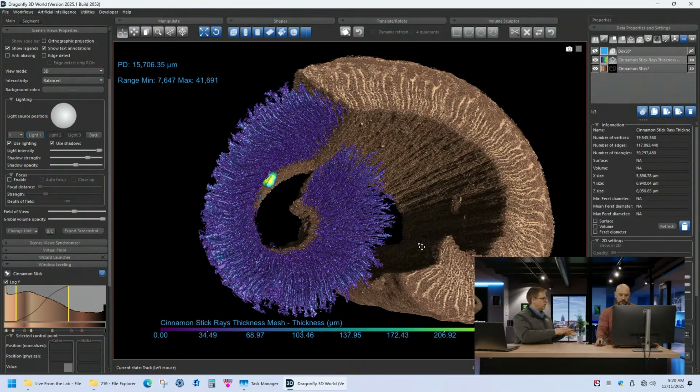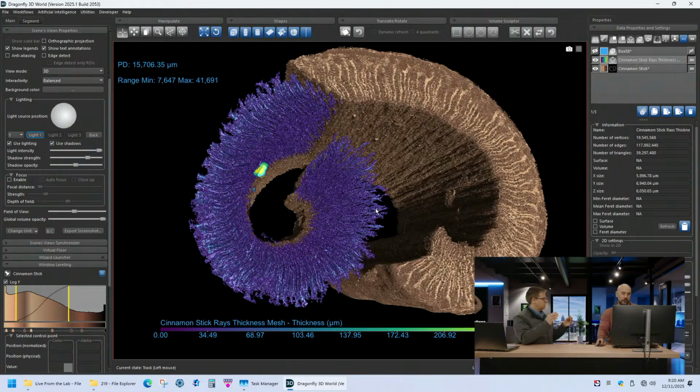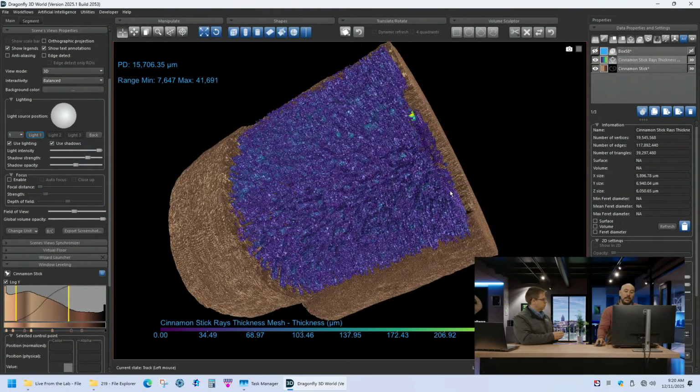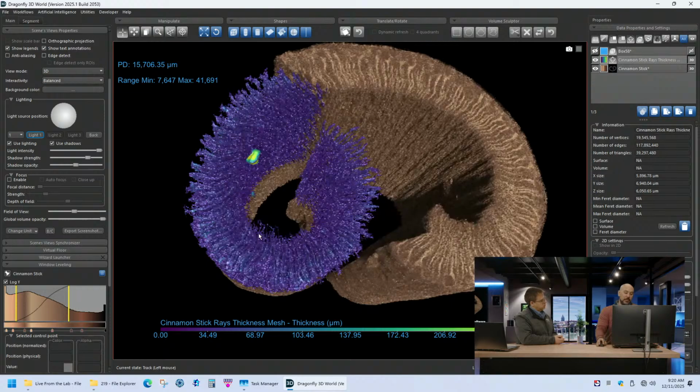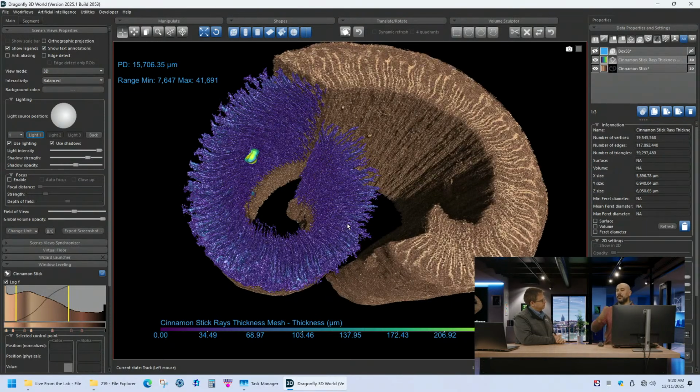But now what the software had to do, you said segment. Segmenting means it connects voxels. Once you get to segmenting, you're thresholding the data set, deciding what part of the histogram is going to be quantified. I always say it's like a light: it's either on or it's off. You're saying this is included in my data or it's not. So that's what we did with this.